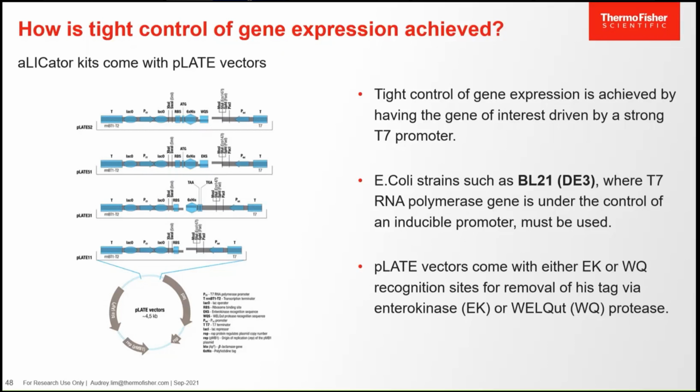It means if you know the His tag position is at N or C, then you can use the N or C terminal kit.